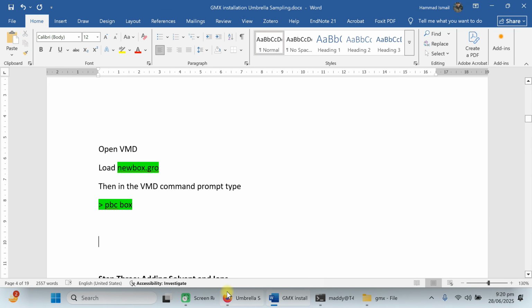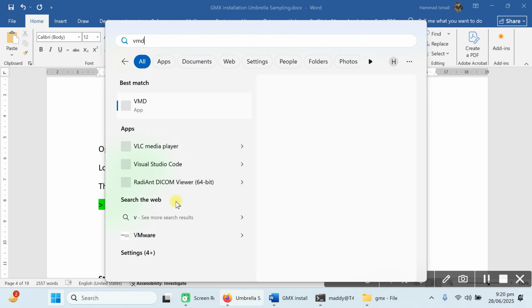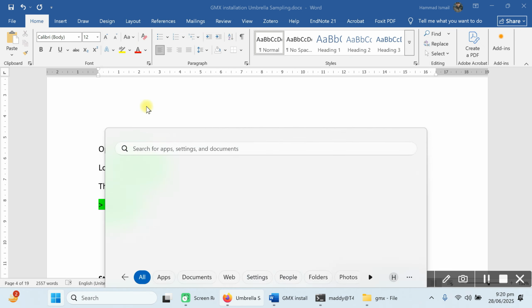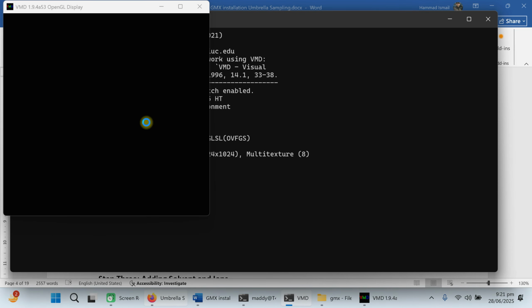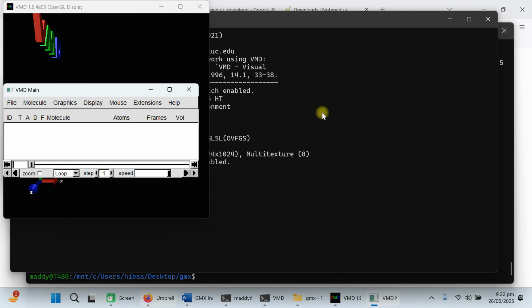Now how can you visualize this new box? Simply go to VMD. VMD is a small, free software tool. How you can install or use the basics of VMD, we have already prepared a video on the demonstration of VMD and analysis. If you are new to VMD, you can refer to that video.